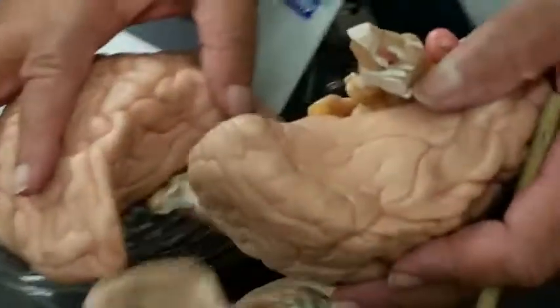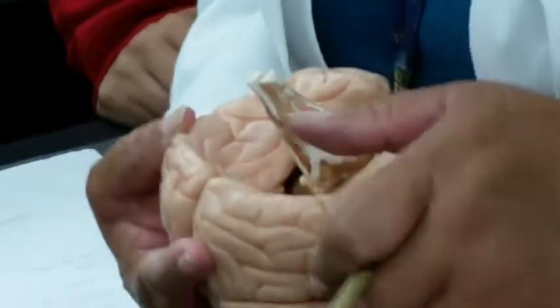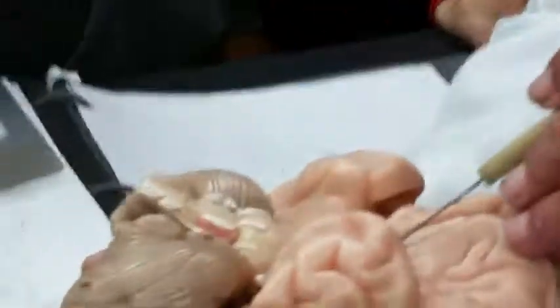Let's put the entire halves of the cerebral hemisphere together again. And let's put the cerebellum. And now you're seeing here, this is a nerve.